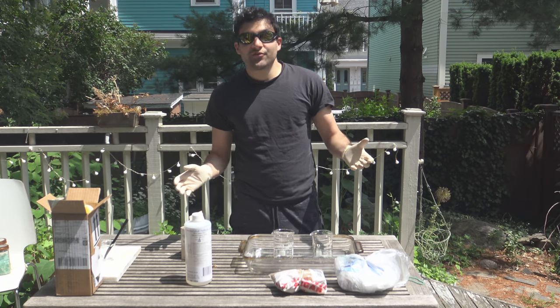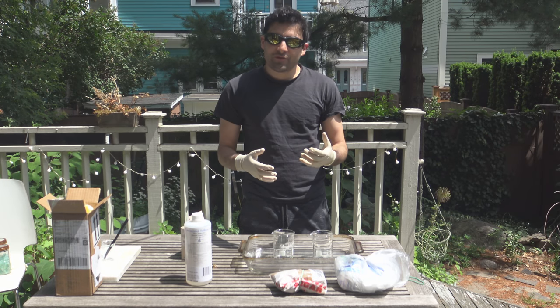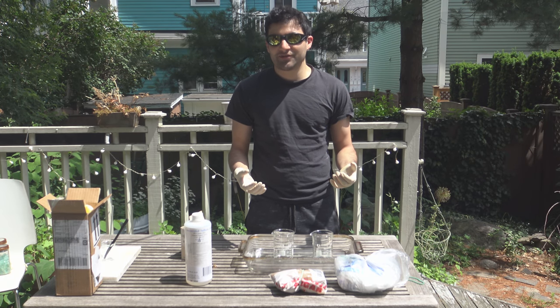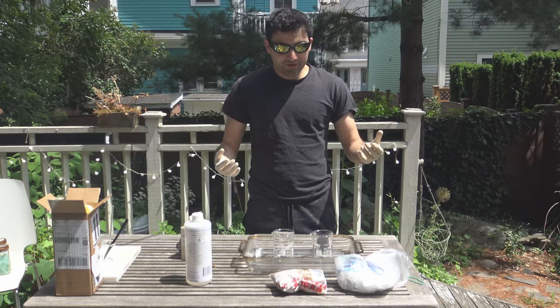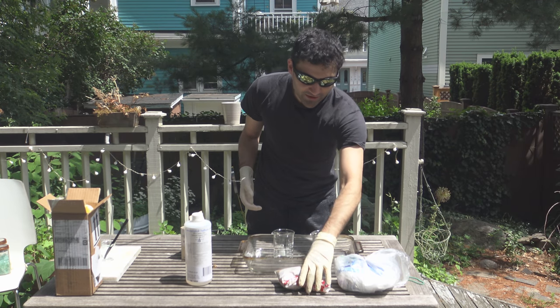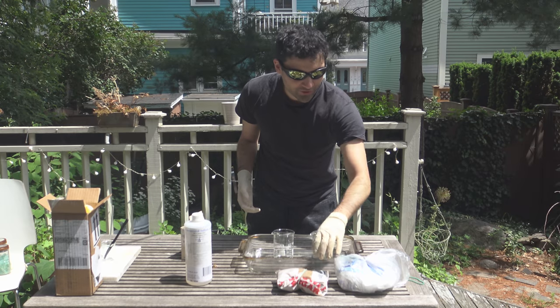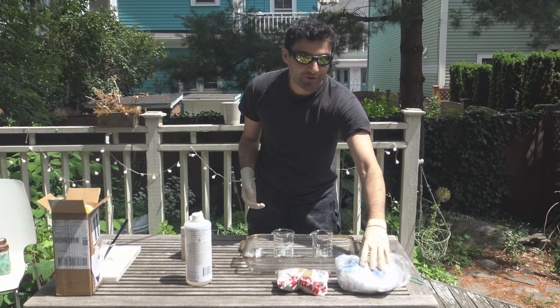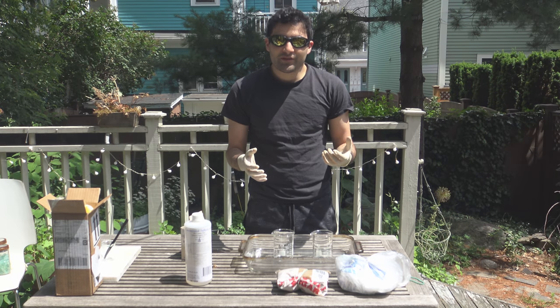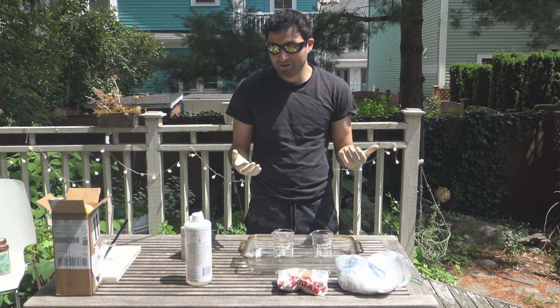Alright, so today we're going to be running a dehydration experiment. This is kind of one of the more interesting ones because there's a very visible reaction. We're making what's called a carbon snake. It's really simple — all you use is sugar. I've got two kinds here: regular brown sugar and some powdered white sugar. I've never really seen if there's a big difference when you run this reaction, so I'm curious myself.